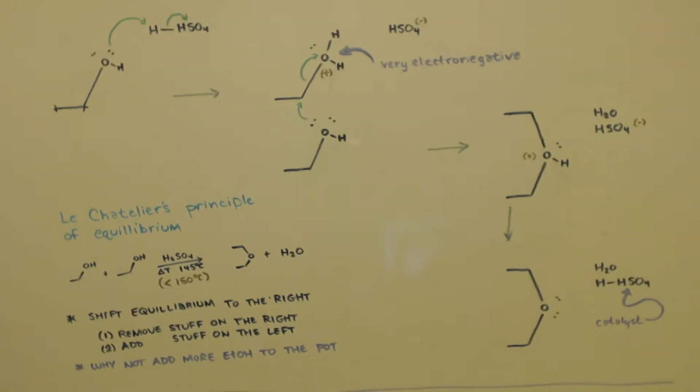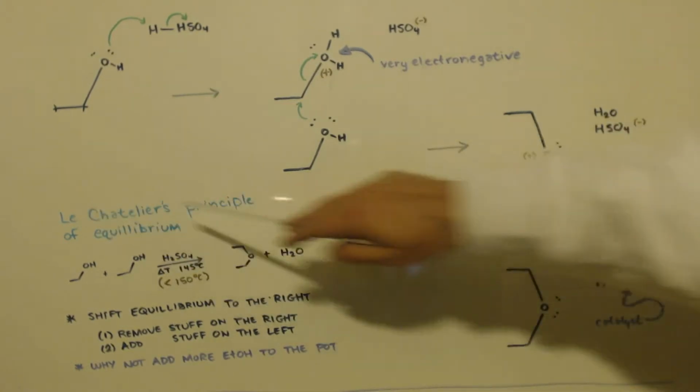Now this is a catalyst. That means it lasts forever. Of course, that just means theoretically. Okay. In real life, you have all these weird side reactions, and heat is decomposing stuff, and blah blah blah. So it doesn't last forever. Okay. I even looked this up so I can see how you write it.